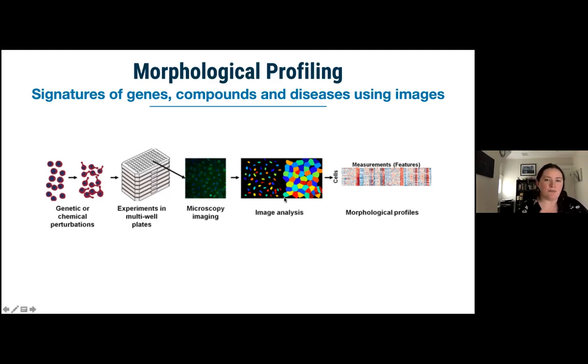So you put this on an automated imager, whatever kind you happen to have. You do image analysis, whatever kind you happen to want to do. And the real magic in the technique is, again, just creating these large measurement sets that have as many measurements as you can possibly manage to fit. Because you can then see how individual measurements go up together or go down together and associate in ways that allow you to group the perturbations in your experiment in sometimes really surprising ways.